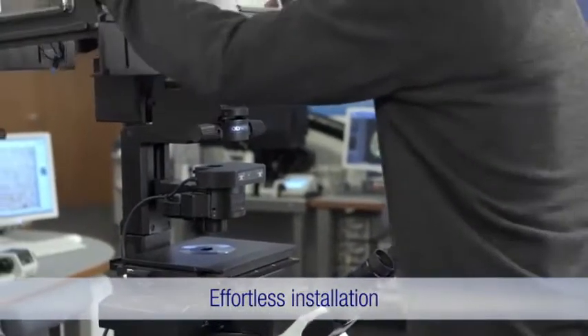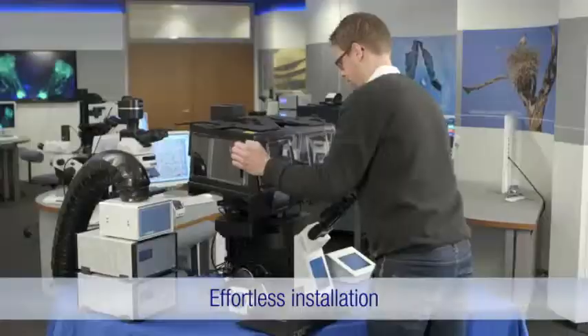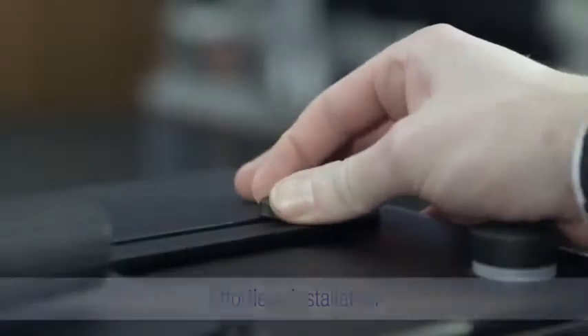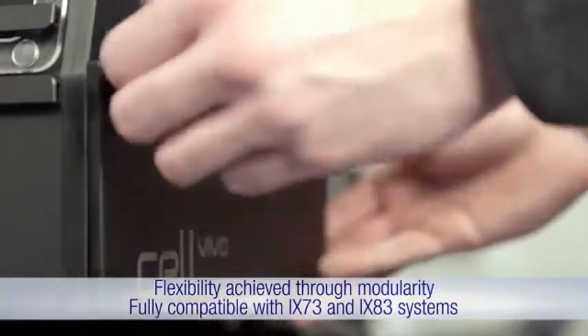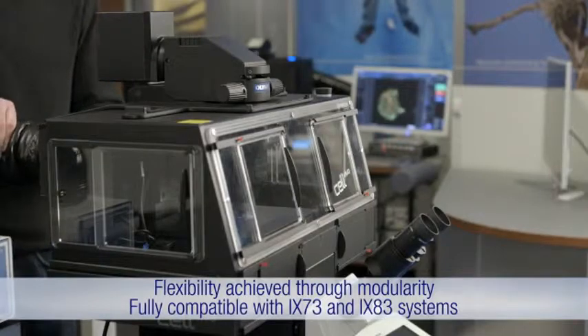Achieving precise control of environmental conditions, the modular and flexible Cell Vivo incubation system is easy to set up in a few minutes without the use of tools. The modular one-size-fits-all concept allows you to build a system to suit every need, so multiple incubators are no longer necessary.